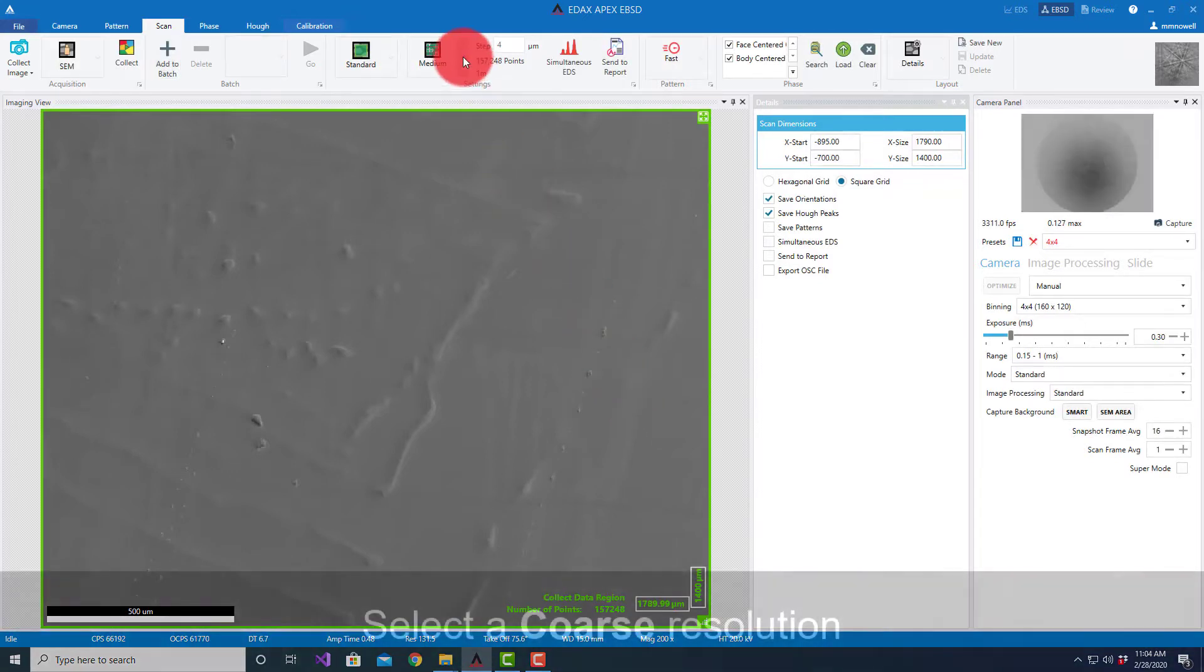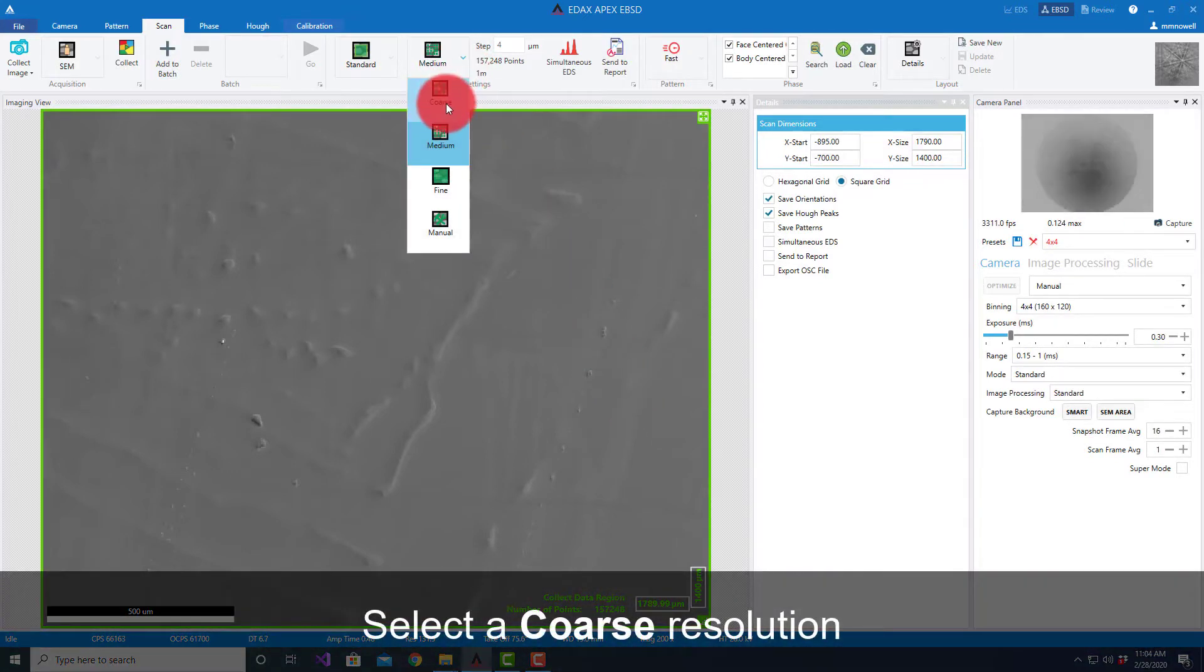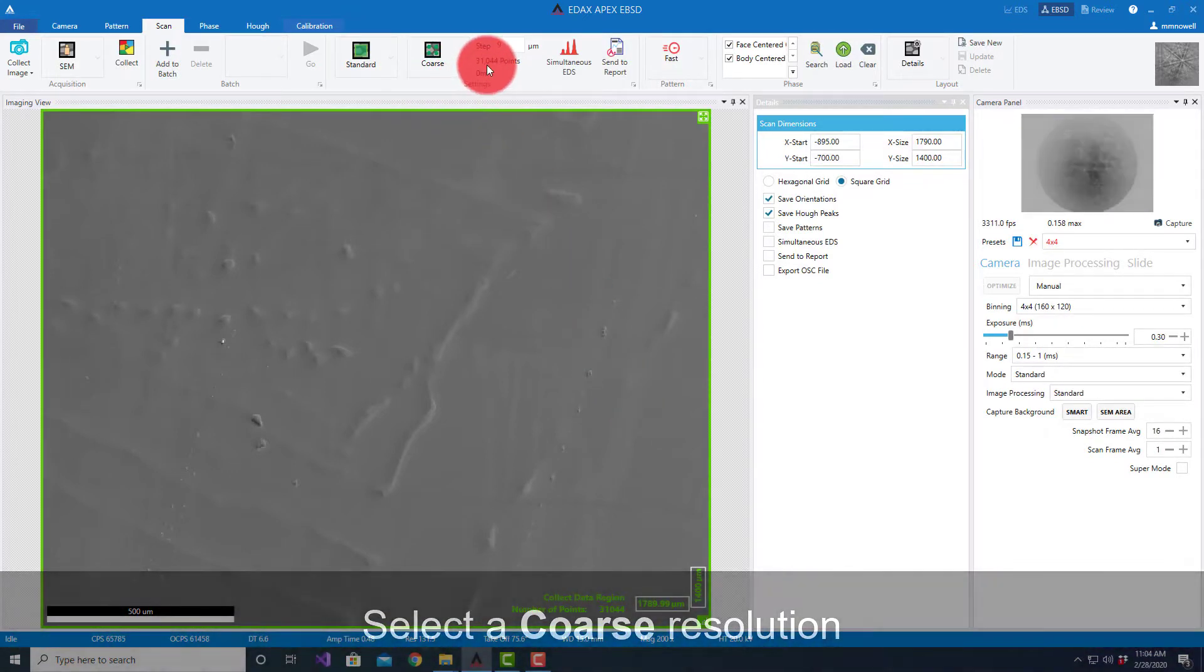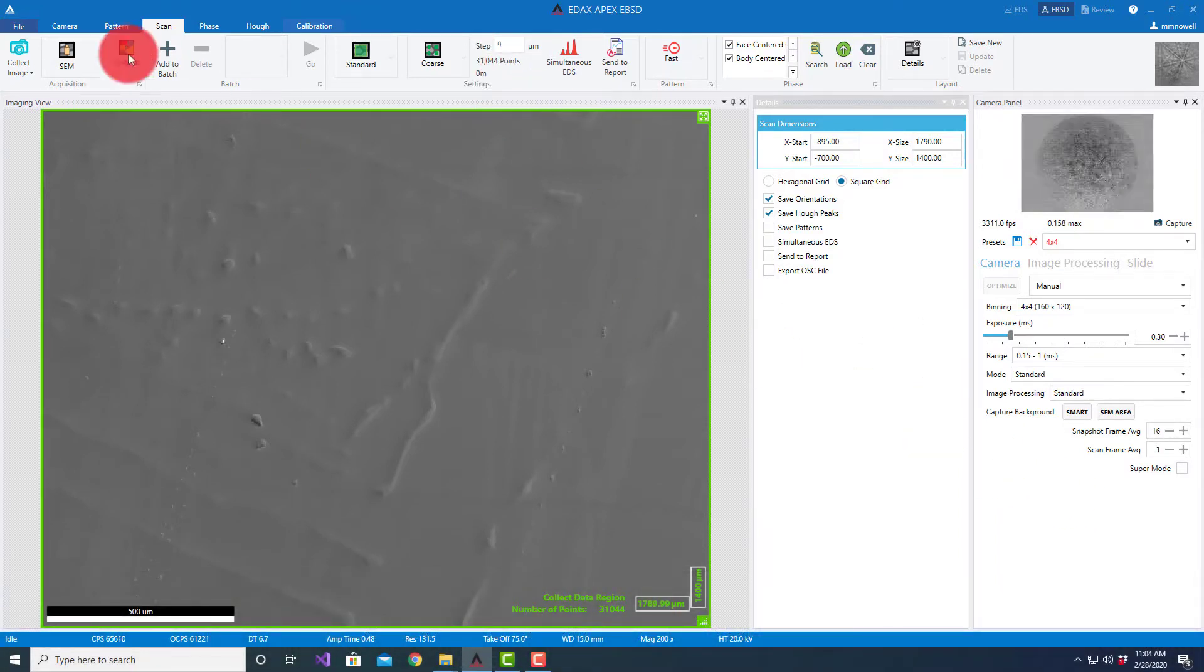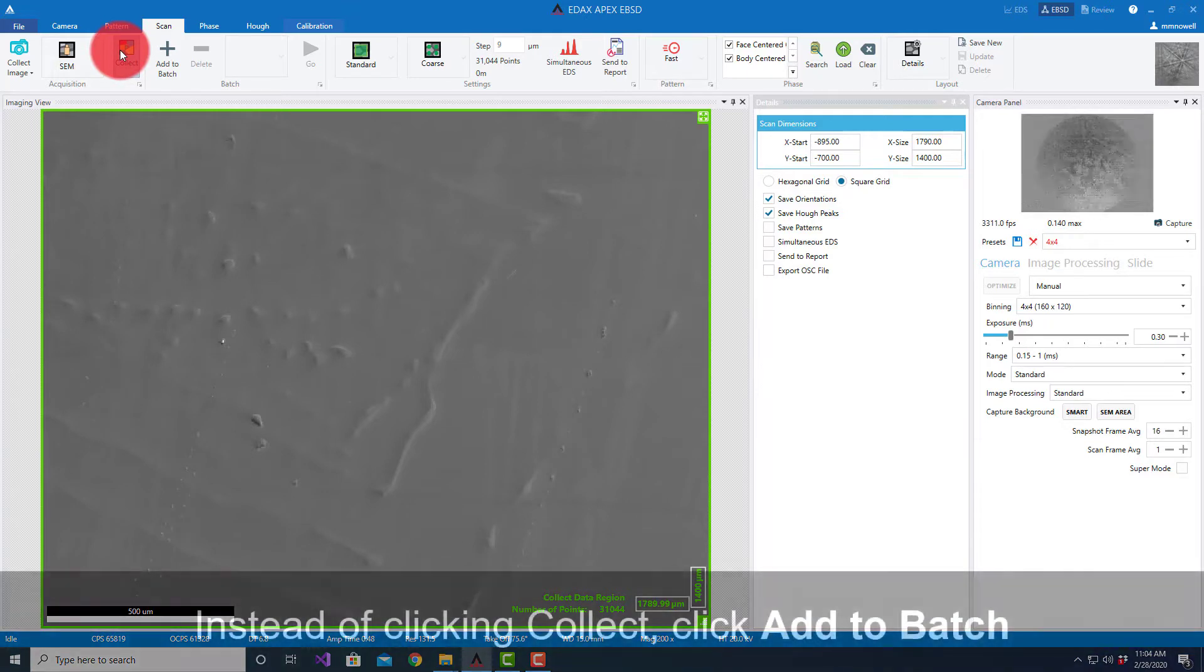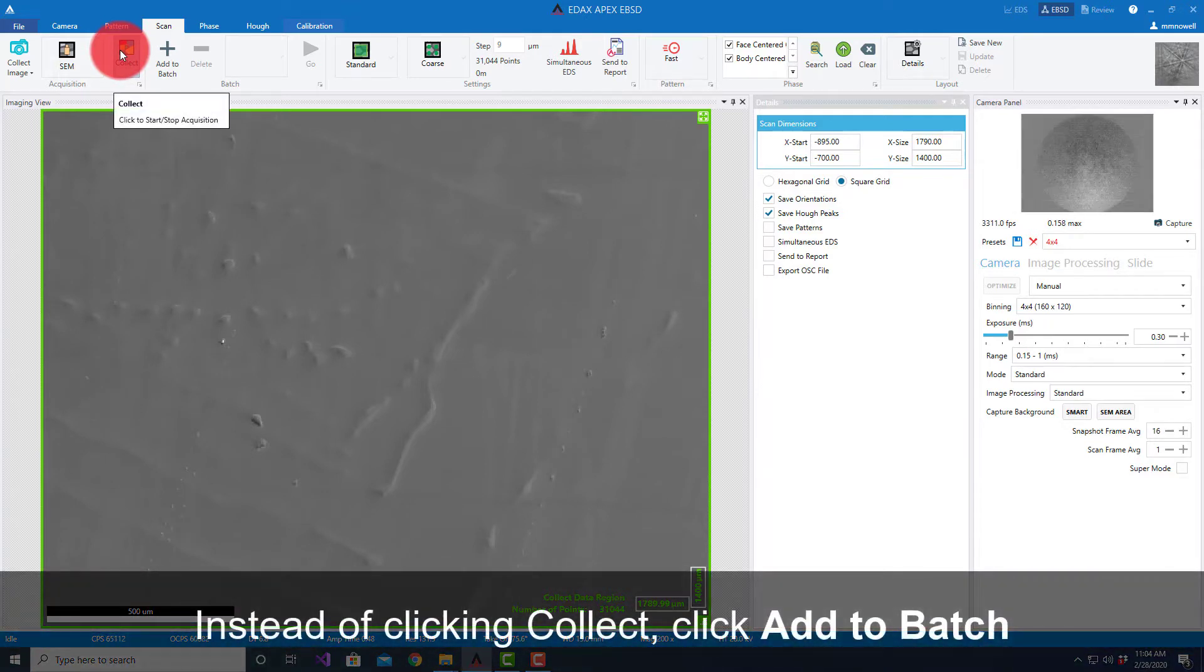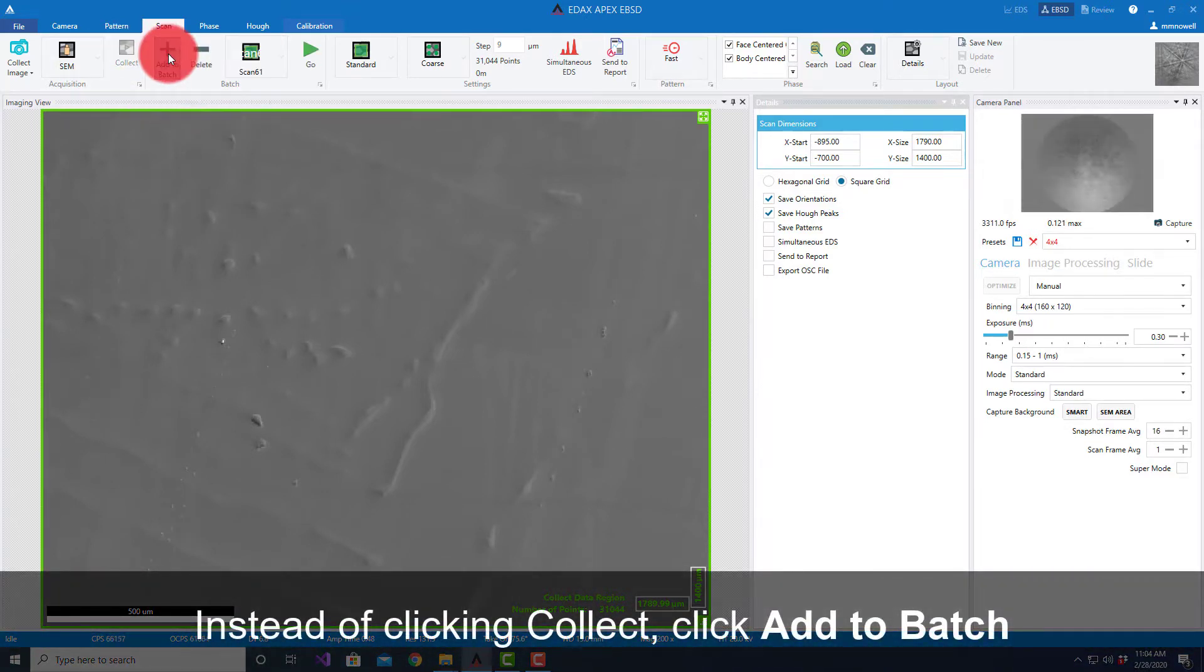Just for brevity's sake, I'm going to select a coarse resolution. This is going to collect a map of about 30,000 points set up with a velocity camera. Rather than just collect the map as we would for a single scan, I'm going to go ahead and hit Add to Batch.